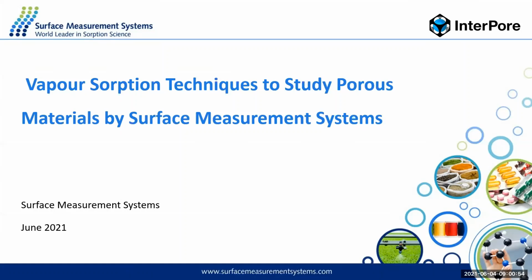Here I would like to introduce you two different vapor sorption techniques for the characterization of complex solids, including porous materials.